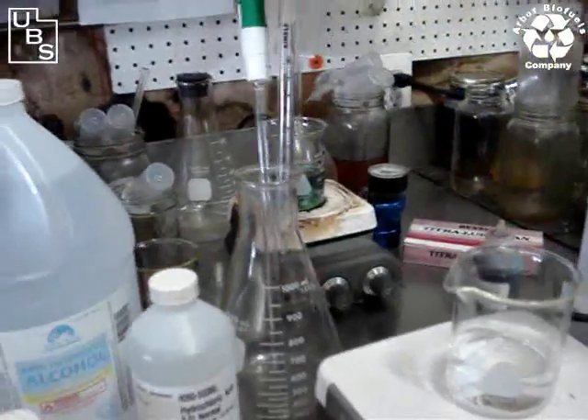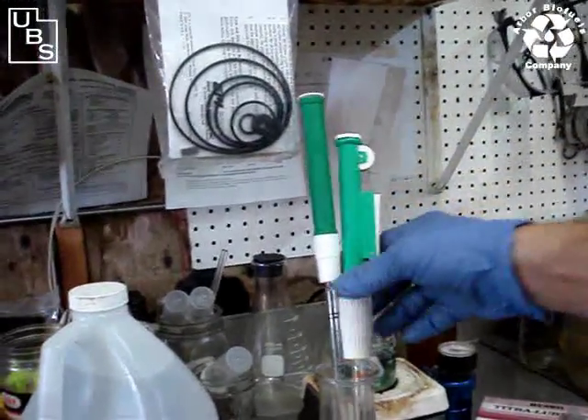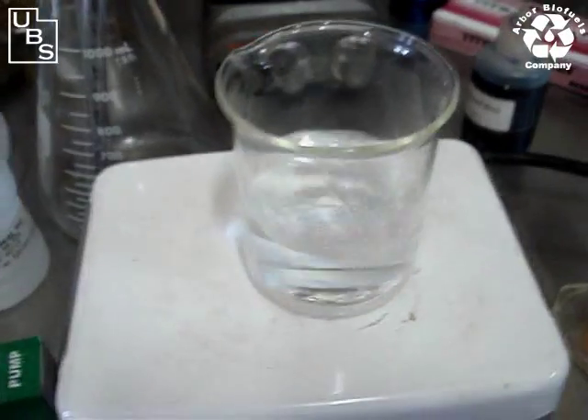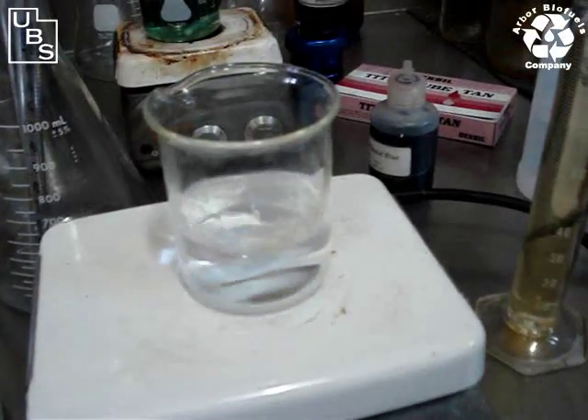We have two pipettes set up — both of them are 10 milliliter pipettes. Over here, we have placed already 100 milliliters of isopropyl alcohol in a beaker, and we're going to turn it on and get the magnetic stirrer going, blending here at just about the right rate.